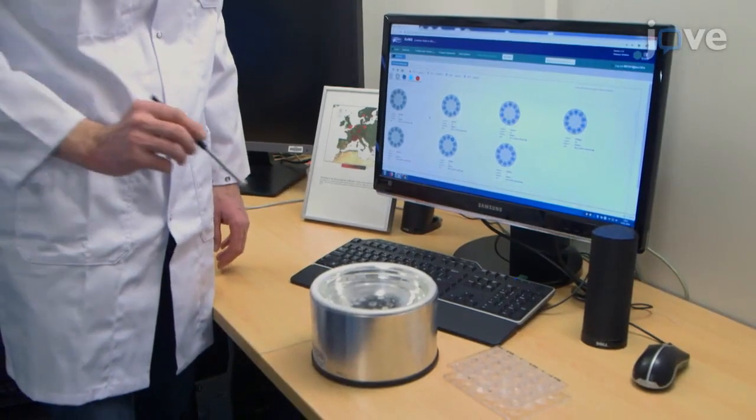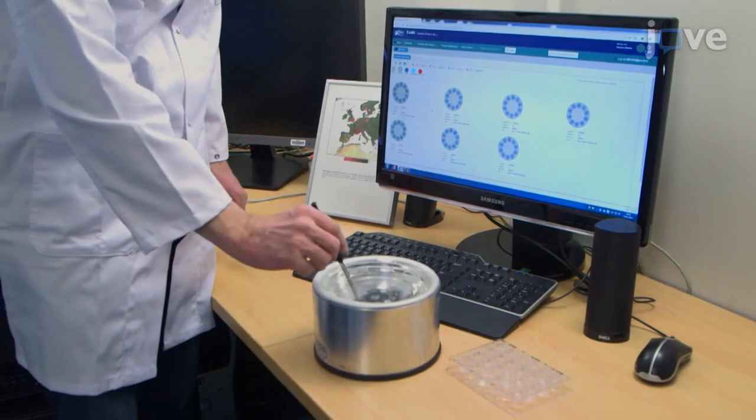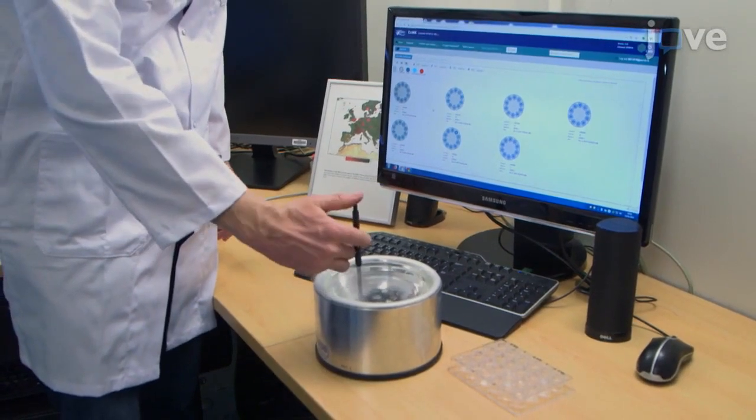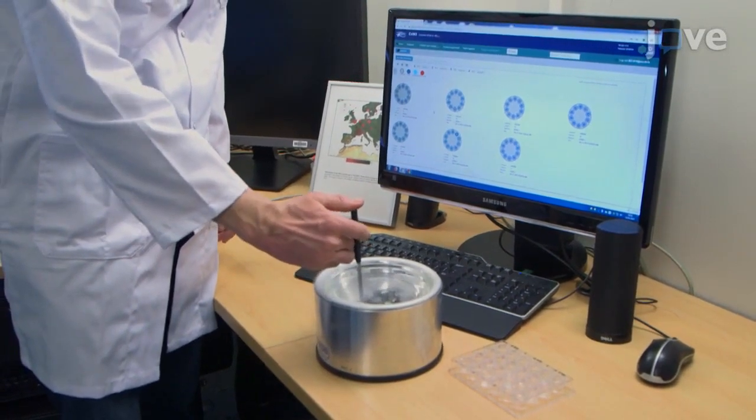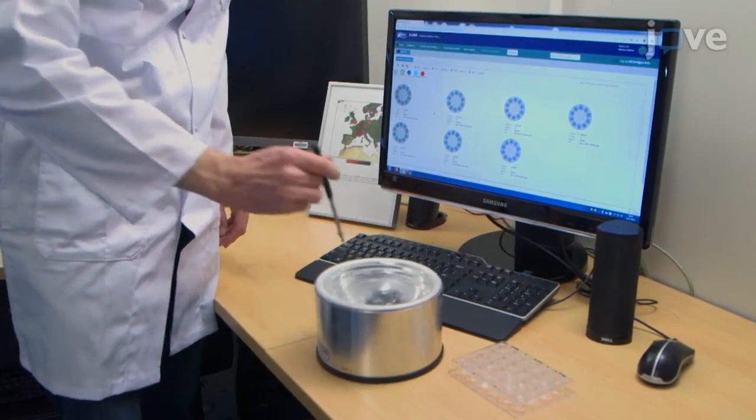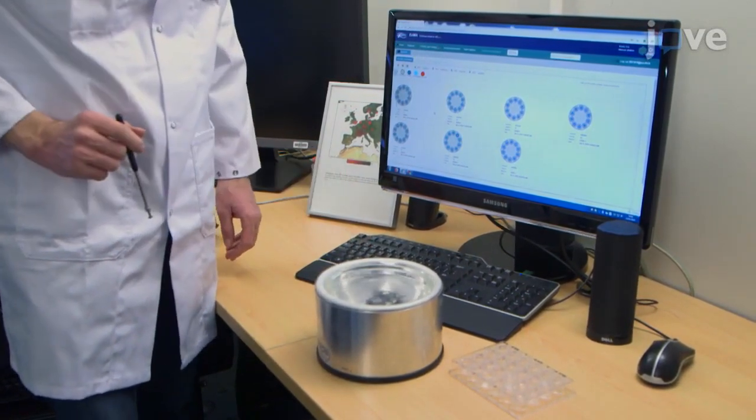To begin this protocol, perform crystal mounting and request beam time on MASSIF-1 as described in the text protocol.